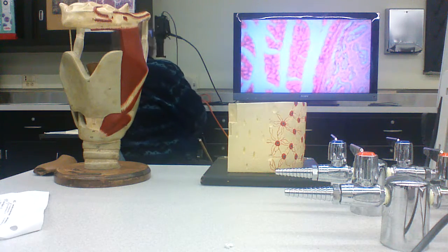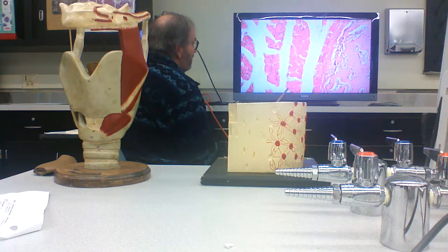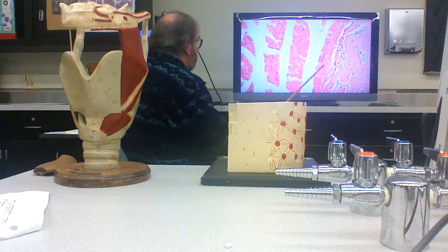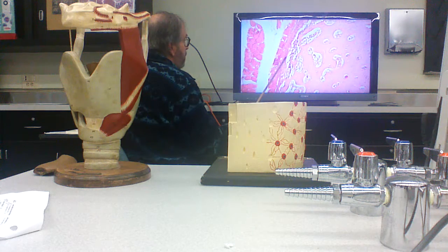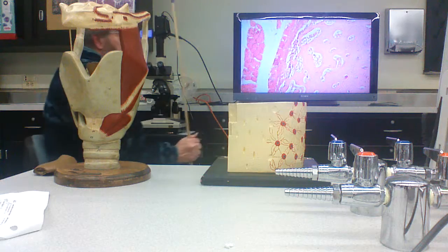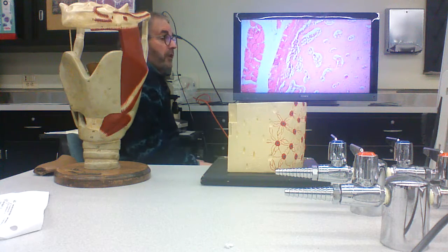So here, on the outside is muscle, pretty much. Could be tendons. Here's the fibrous sheath of the bone, the periosteum. And on the inside of the periosteum, you have an osteogenic layer. These are osteogenic precursor cells, and they're going to be busy making bone matrix on the outside.